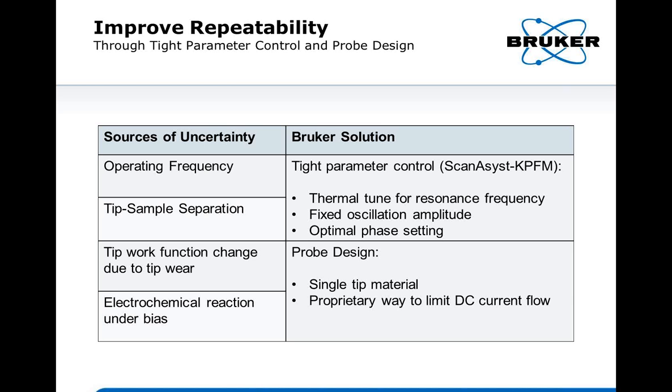It includes two parts. Let's say you use one probe, you engage different times, you want to see whether you can get the same number. And the other thing is, what if I change my probe, change a different tip, different probe, and can I still get the same number? That we want to know.